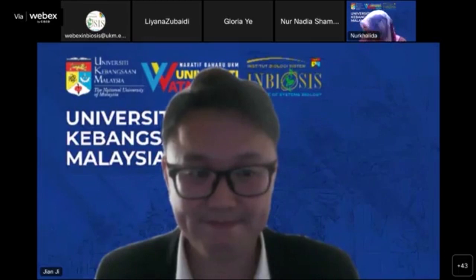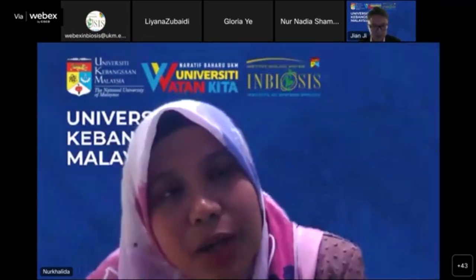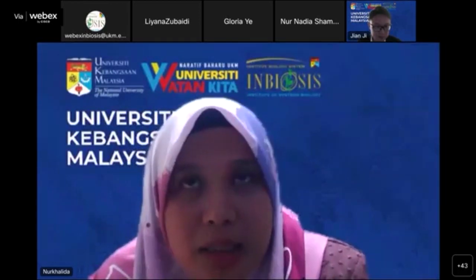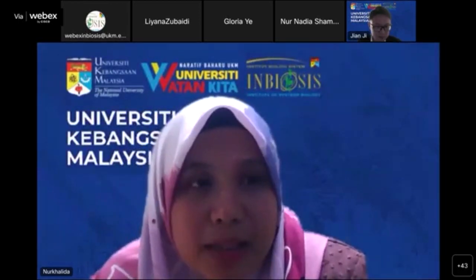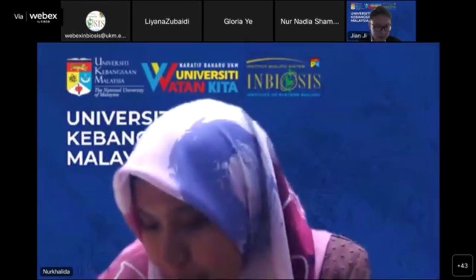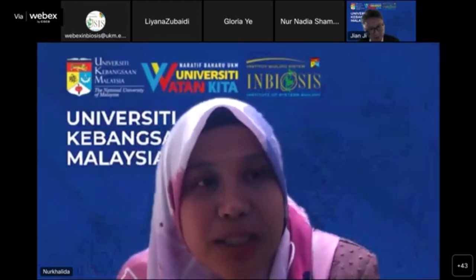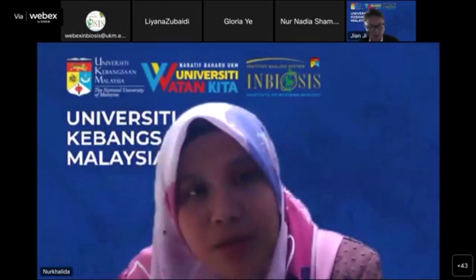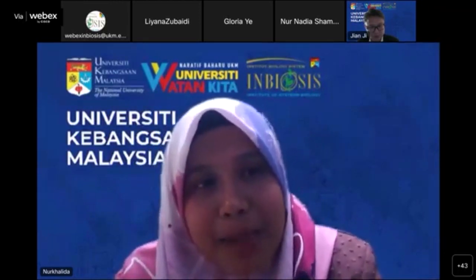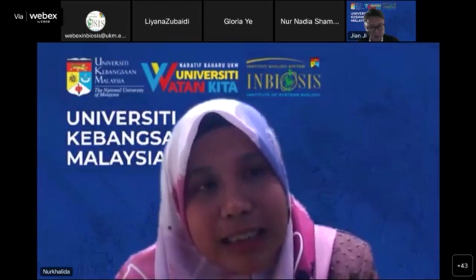All right. Dr. Jian, I have a question because during your presentation, you mentioned that the database for GCMS is much lower than the features that we detected. So basically, we will have many unknown peaks or features. So in your opinion, if we get this peak, what should we do next? I mean, for the future study.